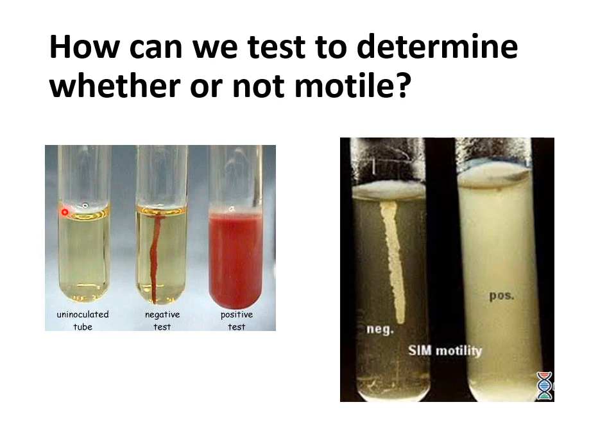You start out with a clear, uninoculated agar. You then place the bacteria in a single stab down the center. Now, what do you notice about this line? The bacteria stayed exactly where you placed it into that agar, because this bacterium is non-motile.